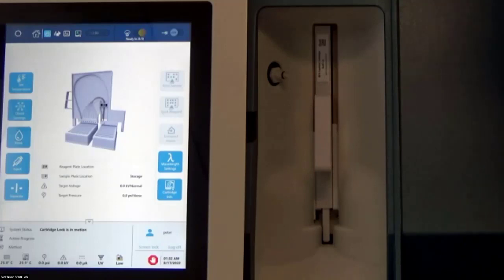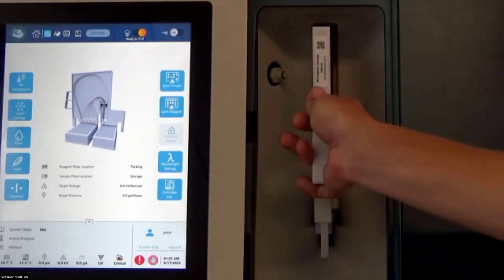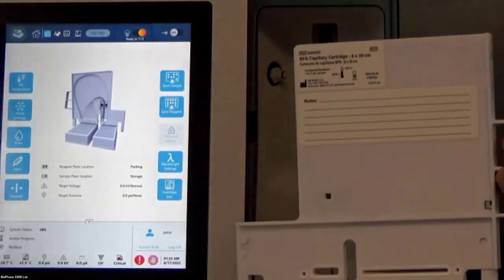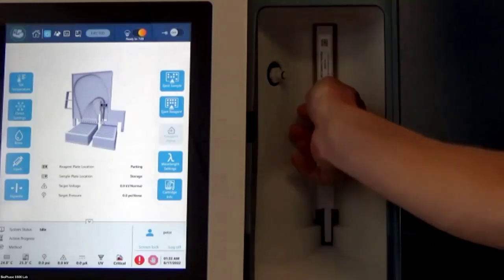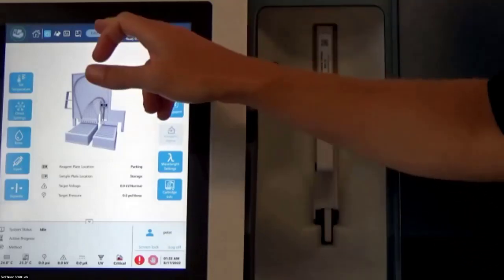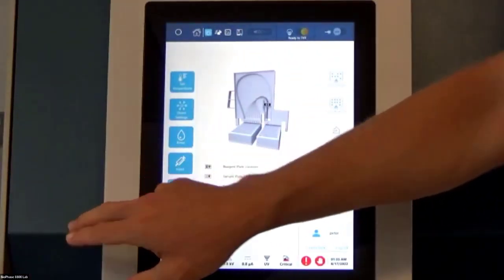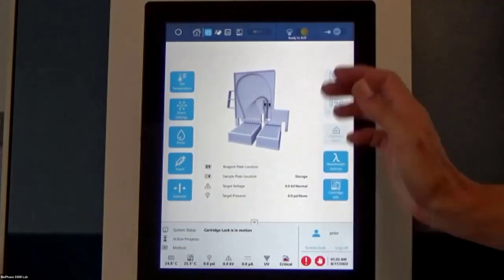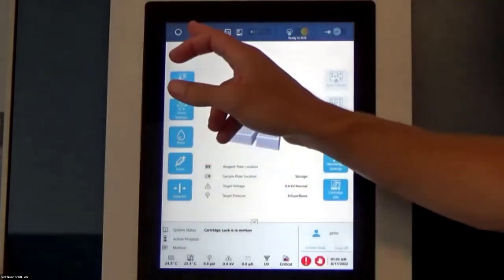You guys can see just how easy it is. It slides right back in. So here, I'm just going to pull this cartridge out. Just like that. Put it back in. Slides right in there. Press the button. It's going to relock it. See this arrow going back as it pushes the cartridge back against the interface block. And then we'll be ready to start our run.